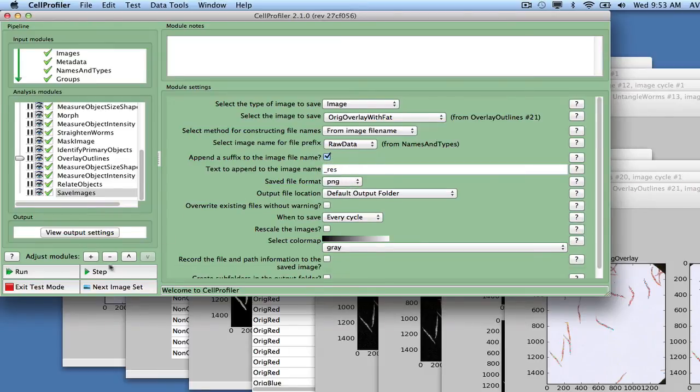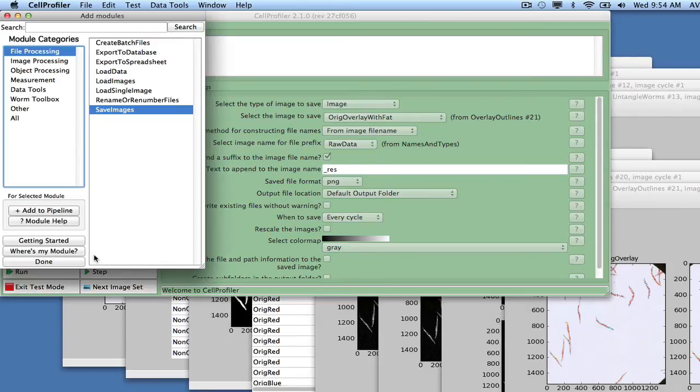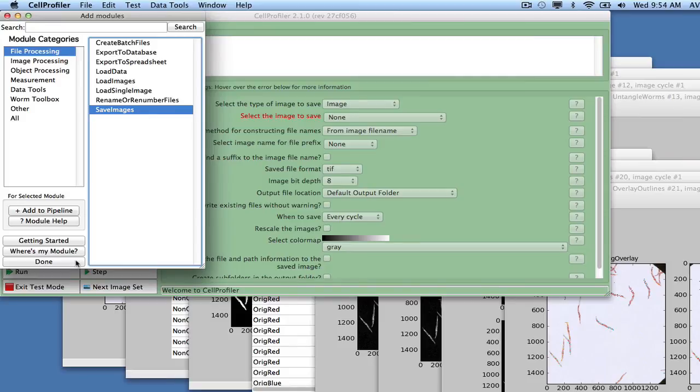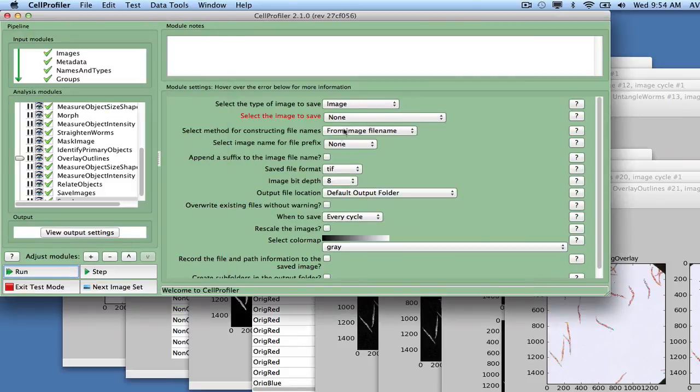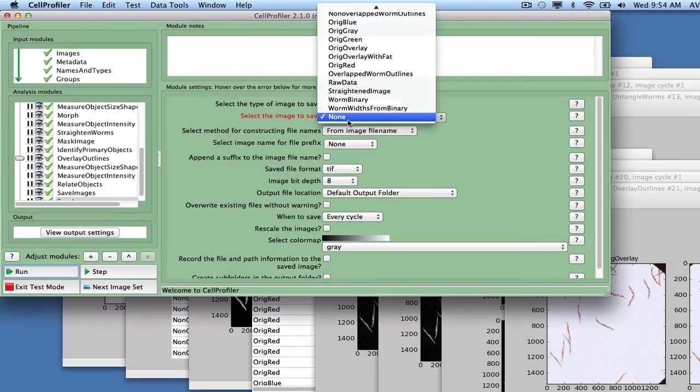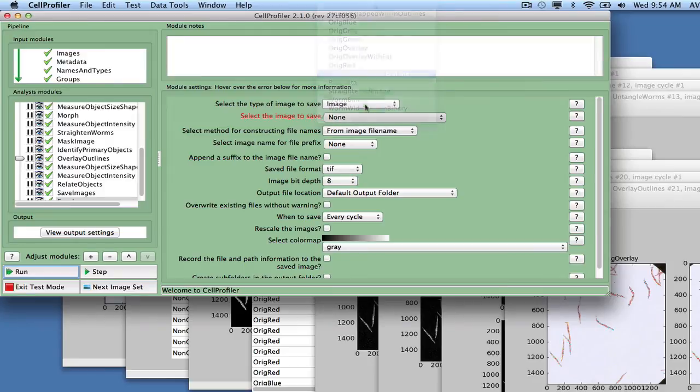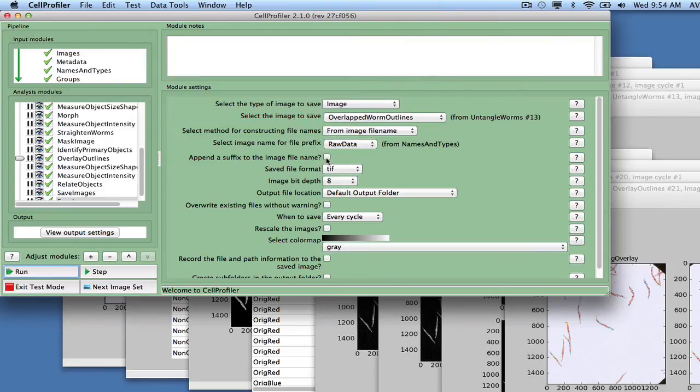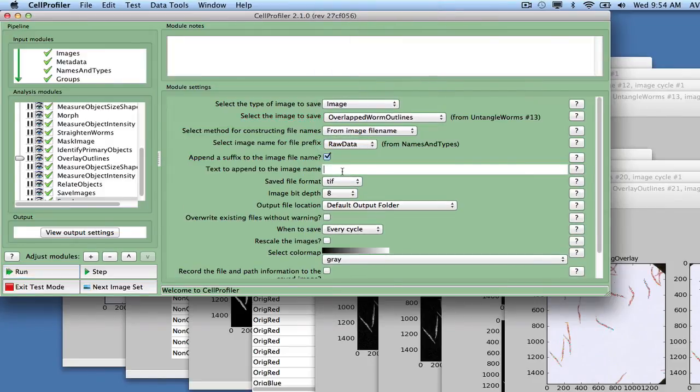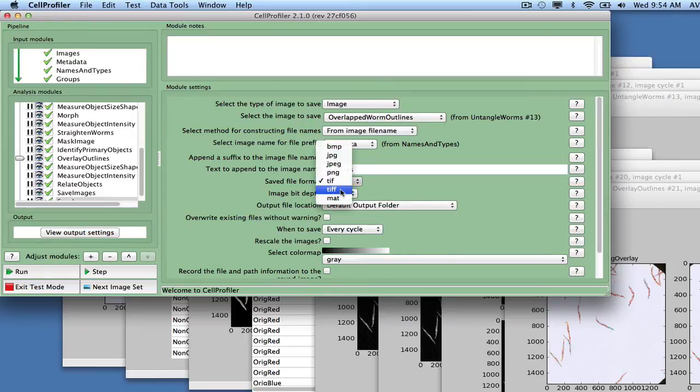Next, add another Save Images module to save the worm outlines, as these will be useful later in the machine learning step in CellProfiler Analyst. Select the overlap worm outlines as the input, the raw data file name for the prefix as above, and Underscore Outlines as the suffix. Also, check the record file and path information to the saved image box.